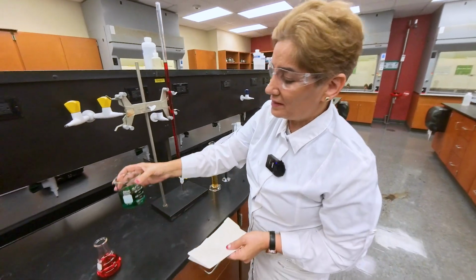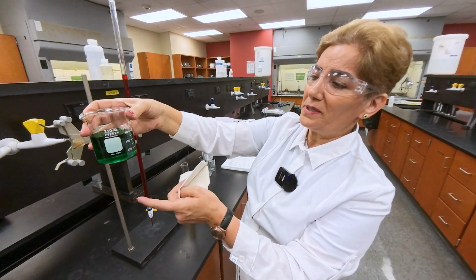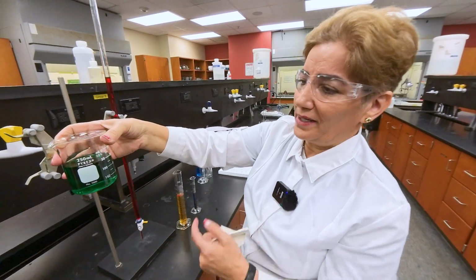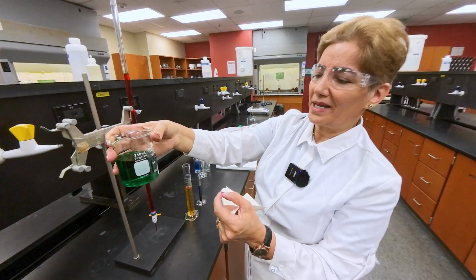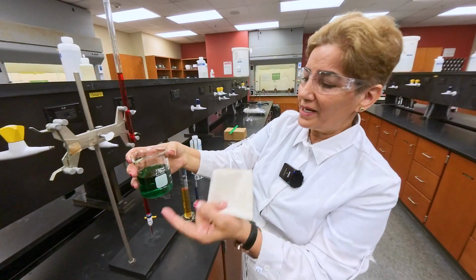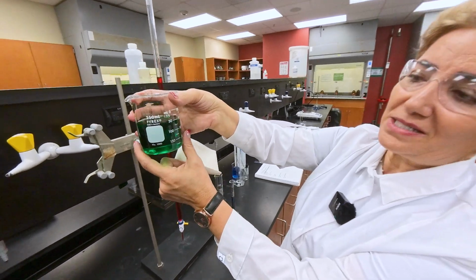Beaker is not the best device for measuring volume. It's not accurate. If you measure like 20 milliliters with a beaker and transfer it to a graduated cylinder, it could be anywhere between 18 and 22. That's just a hypothetical number I'm talking about. It's not going to be an accurate number, because a beaker is for transferring, for mixing, for heating up liquid, not for measuring volume. But we can have an approximate volume.